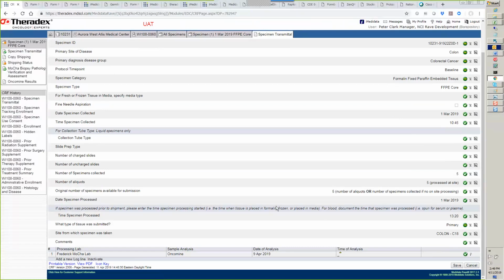So are we going to have to go in and for every single time point do this? Or can this be, again, like a batch function where we could select all samples and then tweak for maybe one sample that had to be repeated and was reported on a different day? It's something that maybe we can take offline and figure out, but I think for a PK lab that's running hundreds of samples per trial, it might get cumbersome to hand type in for every one.